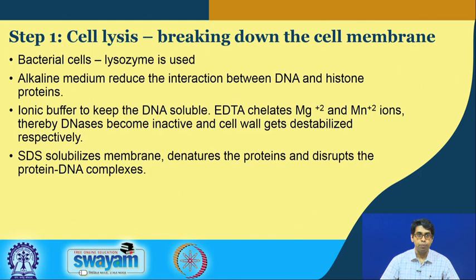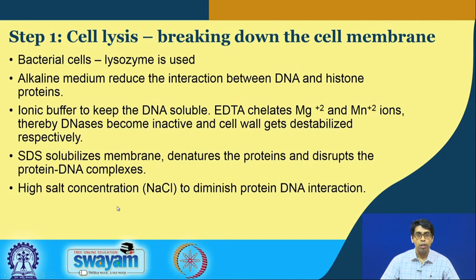SDS is added to solubilize the membrane. This SDS is sodium dodecyl sulfate, and it is the same surfactant that we use when we run SDS-PAGE gel. So we have seen there that it can denature proteins. When we add SDS, it disrupts the membrane, and it also denatures the protein so that all the protein-DNA complexes that are present will be disrupted. High salt is used to again disrupt the protein-DNA interaction, because these interactions are also driven by electrostatic forces.